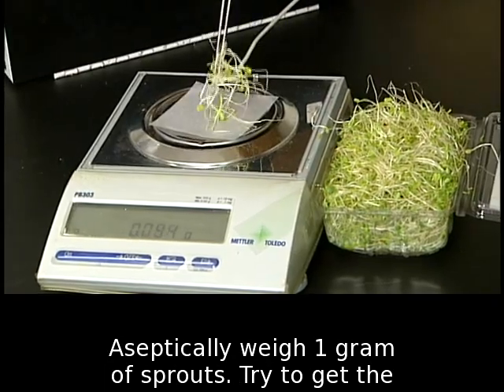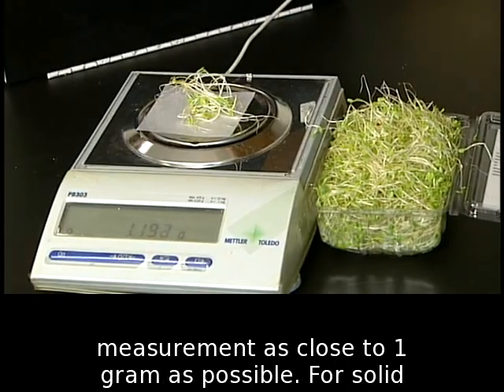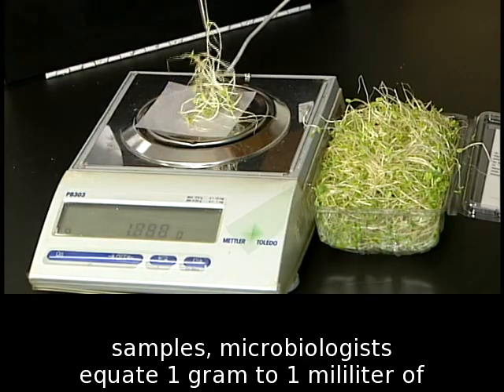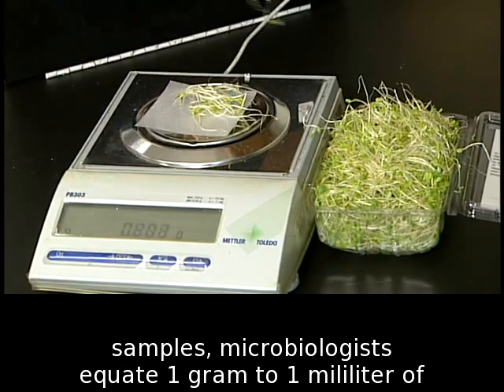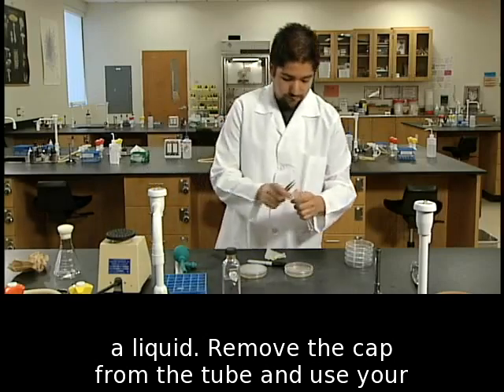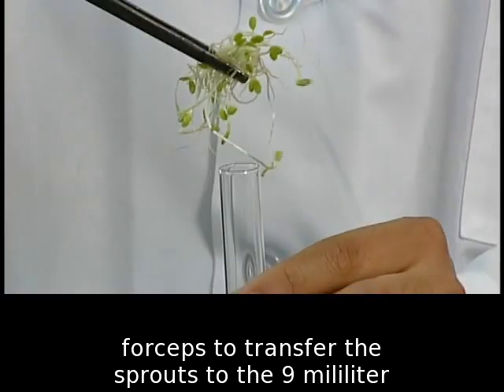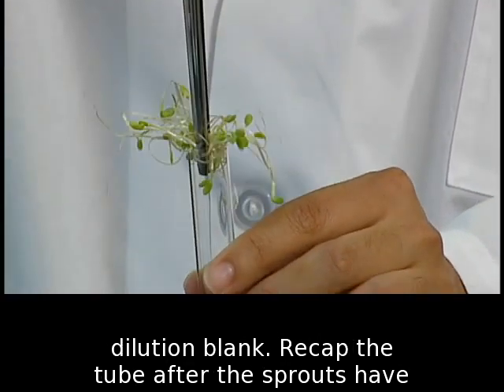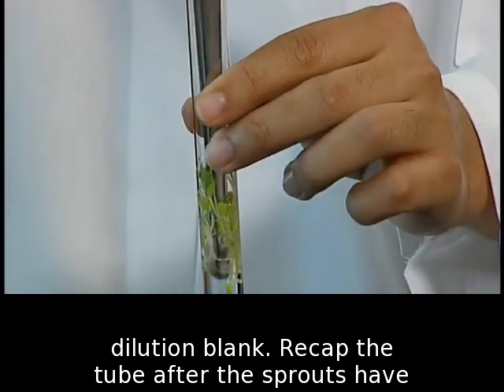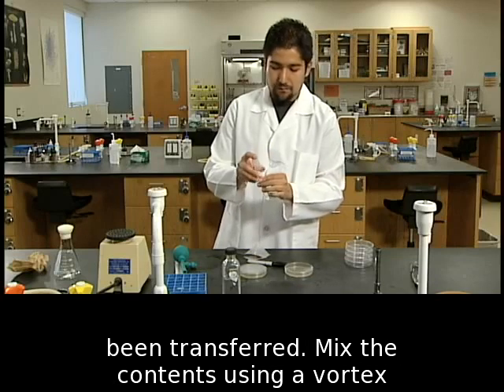Aseptically weigh 1 gram of sprouts. Try to get the measurement as close to 1 gram as possible. For solid samples, microbiologists equate 1 gram to 1 milliliter of a liquid. Remove the cap from the tube and use your forceps to transfer the sprouts to the 9 milliliter dilution blank. Recap the tube after the sprouts have been transferred.